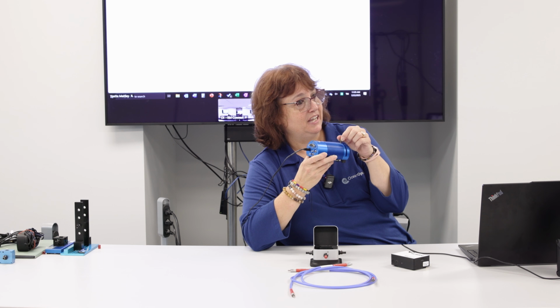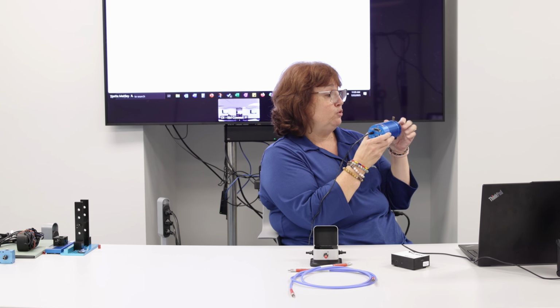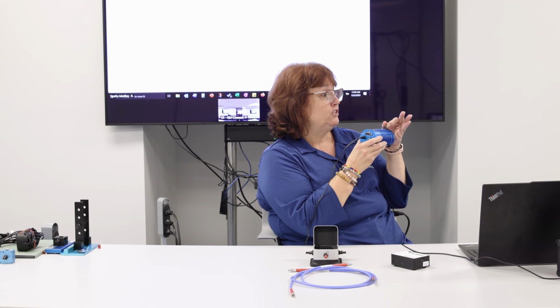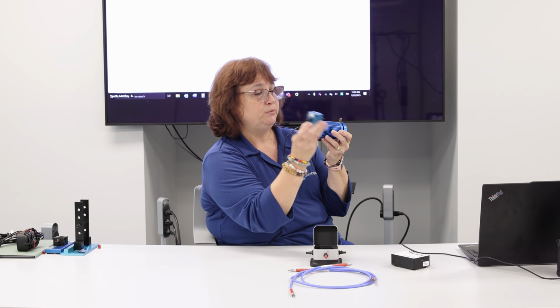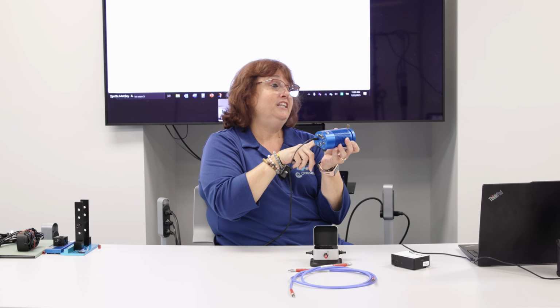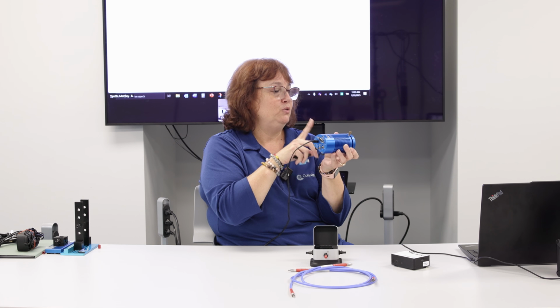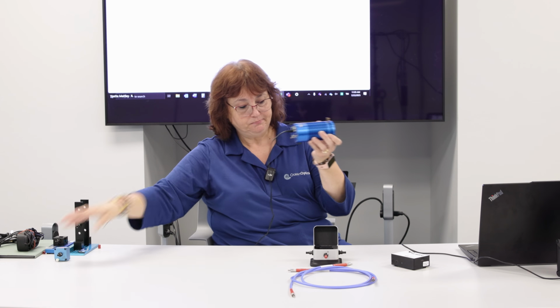This is the one that has that attenuator, which is very nice, so you can deal with saturation on the spectrometer. Instead of this inline attenuator and an extra fiber, I just need this little screw. It's only in the visible though. So for the UV, you'd have to go to an attenuator like this.